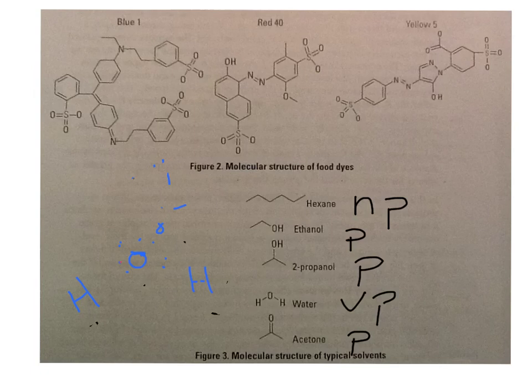So that being said, I can't erase all these. I'm going to show you a couple of the samples. I went ahead and took all of the samples, the red, yellow, green, and blue, and I put them into each one of the solvents. Okay, so take a look at the solvents that we have here. I'm going to show you what they look like, as far as when I did the chromatography in the different solvents.